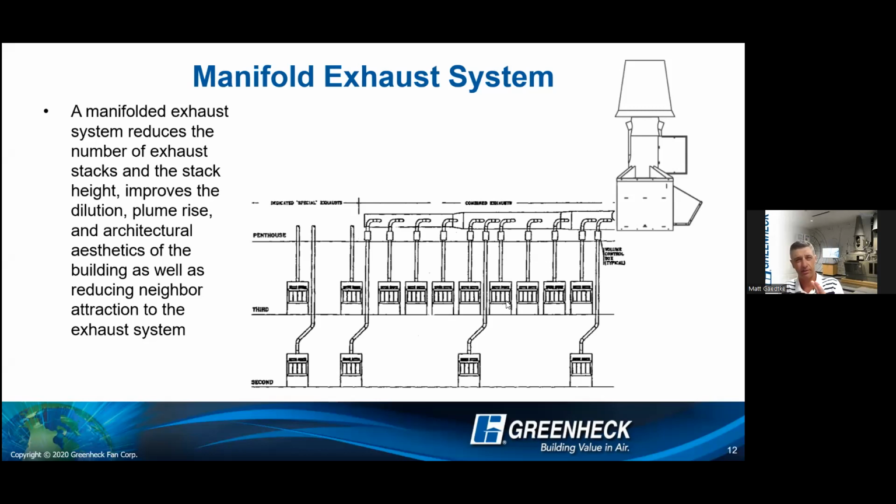neighboring hood, right? So this research needs to be pretty compatible. So if you do find that you have a situation where things aren't compatible, you pull them off to the side and you treat them differently. So radioisotopes, perchloric acid, they'll have their own individual system off to the side. In this particular case, they'll have their own little exhaust fans up on top of the roof deck. But by and large, the more general stuff we can team up together like we're seeing on the right.